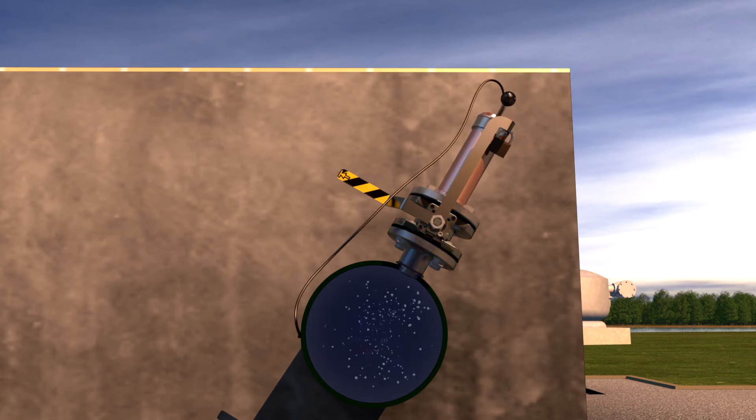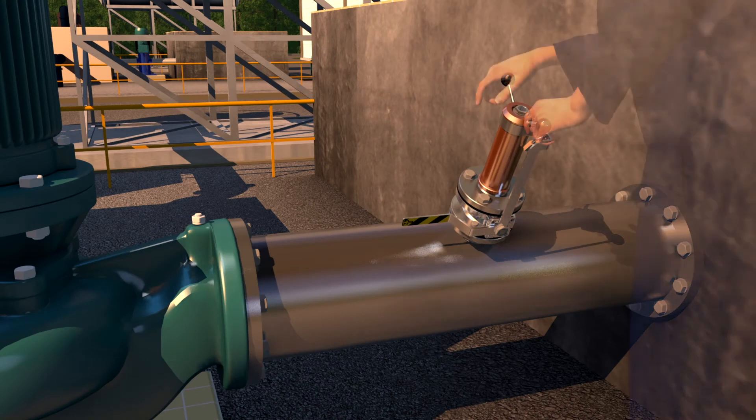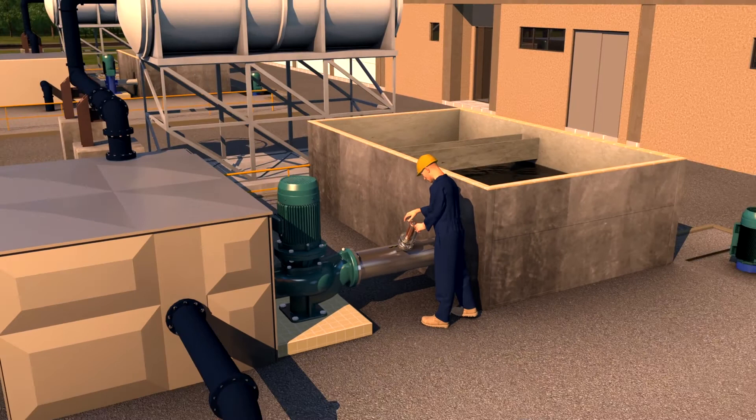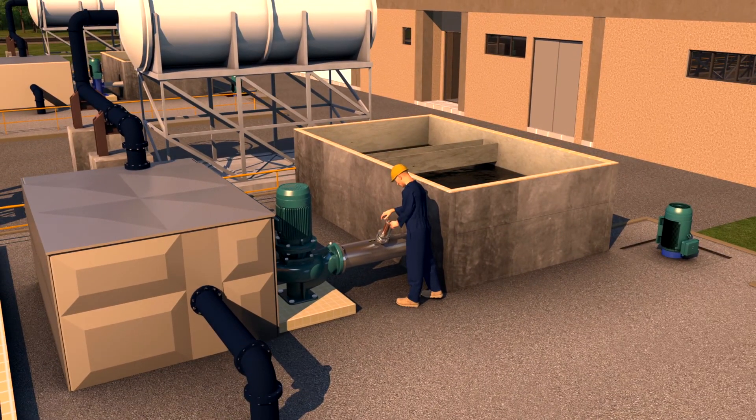By helping to simplify the process of insertion and removal, the assembly helps to further underline the inherent operational benefits of ABB's digital sensor range.